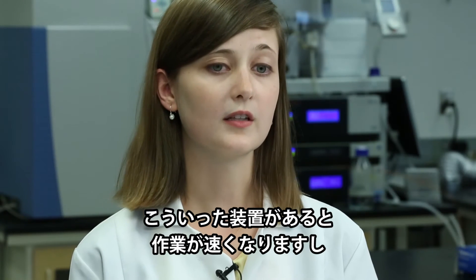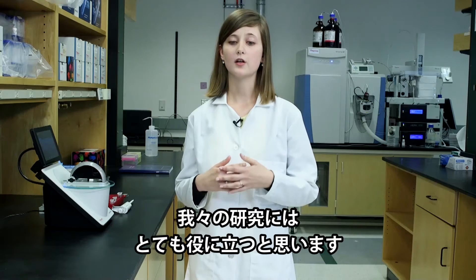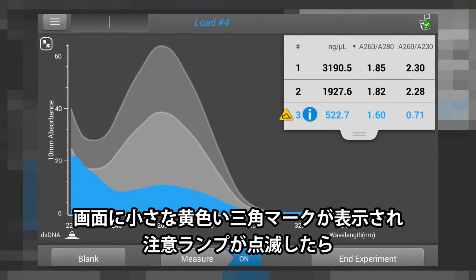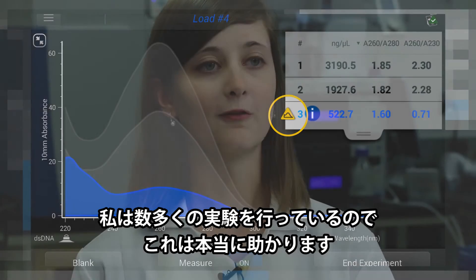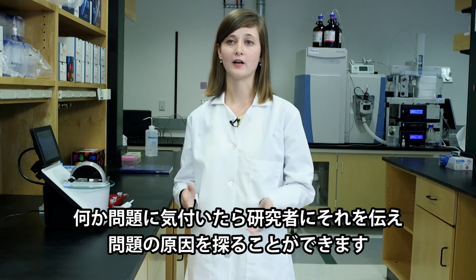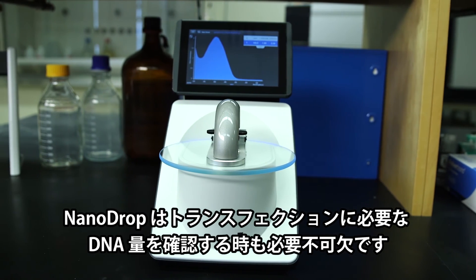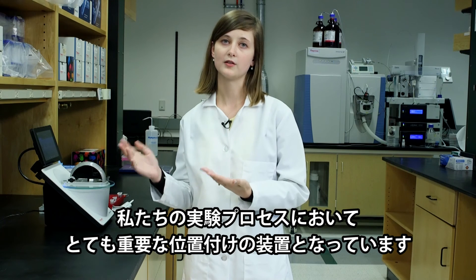I think an instrument like this would help us further our research because it makes work faster, and it definitely shows you when there's an error. If a little light flashes up with a little yellow triangle, that should be noticed. Since I'm doing so many of them, if I can just say something's wrong here, I can go talk to the investigator and figure out what's going on. The NanoDrop is essential to knowing how much DNA we need for transfections. It's pretty much a staple part of our process.